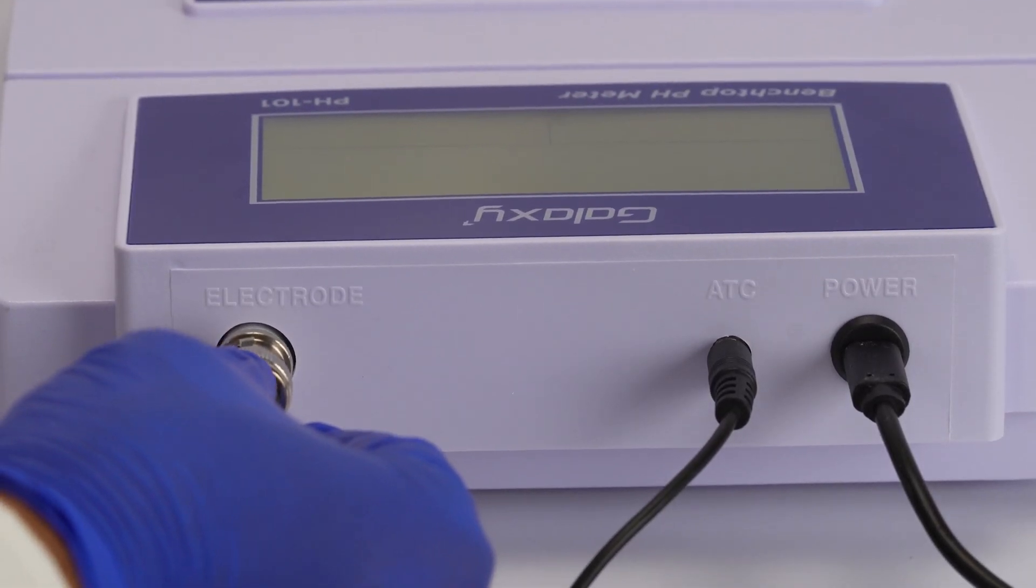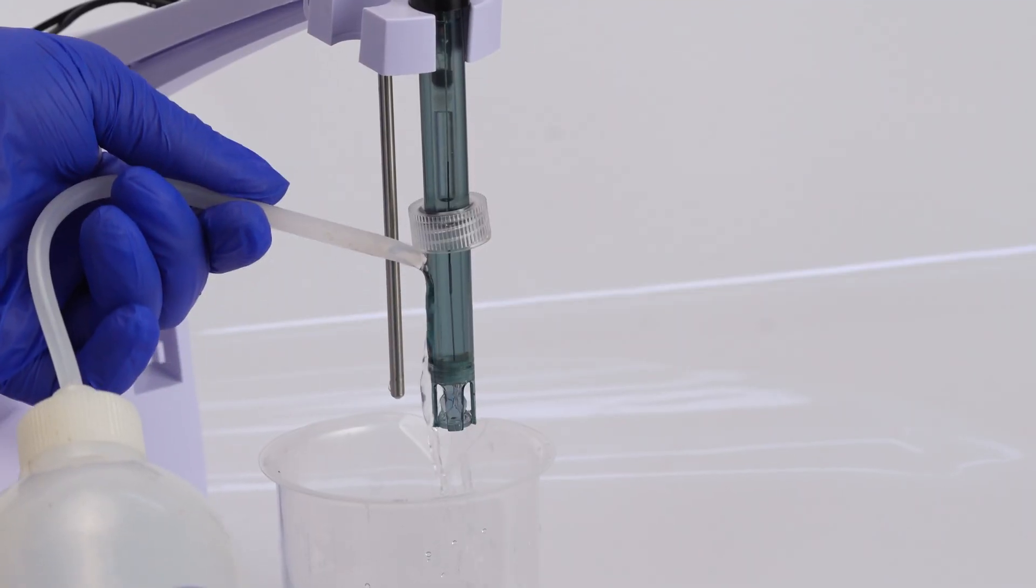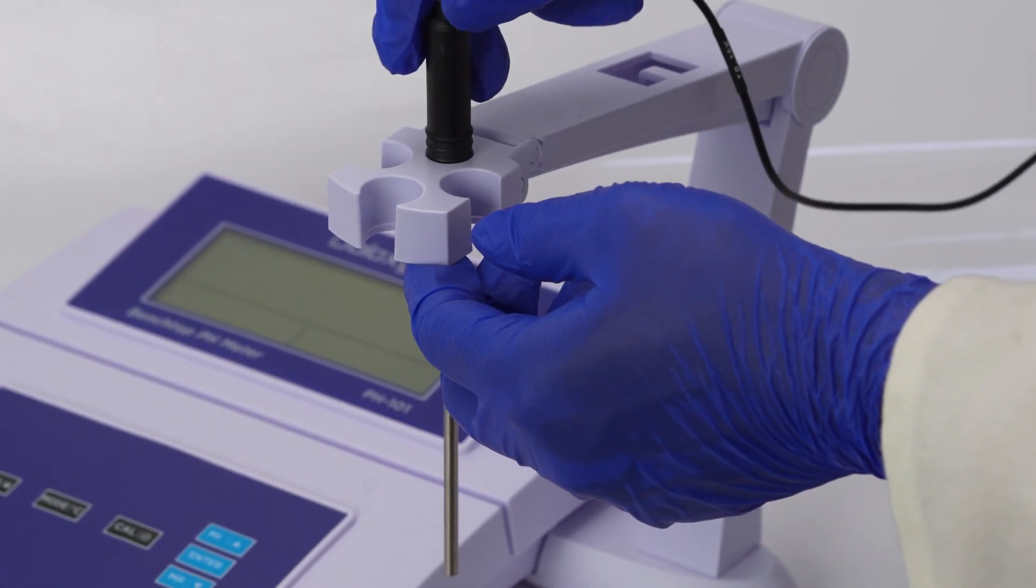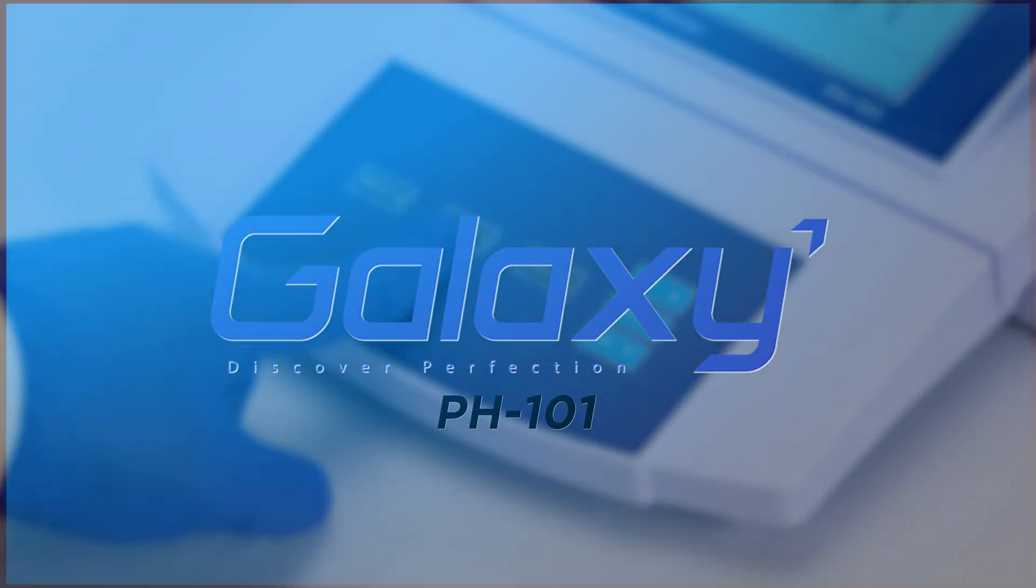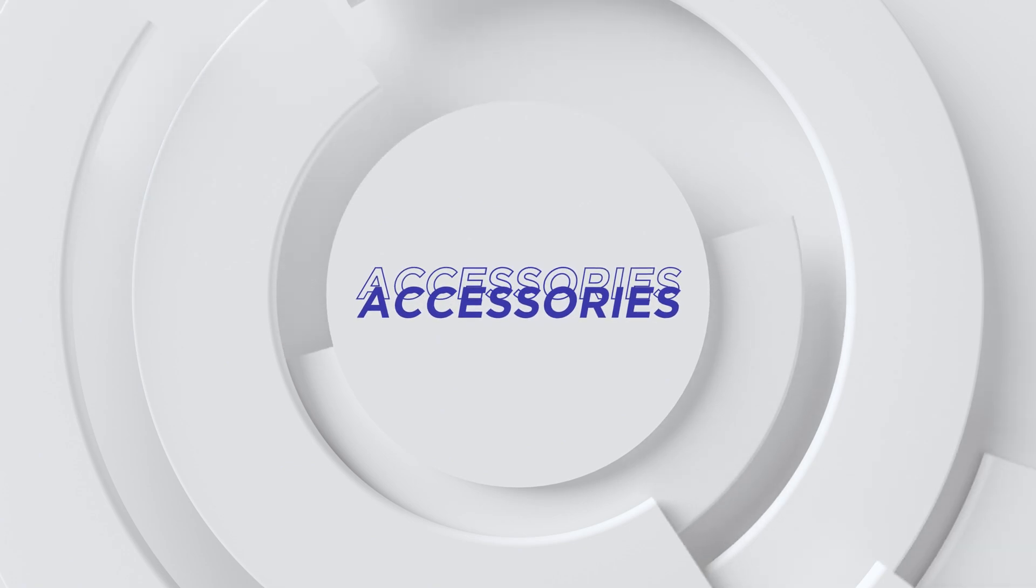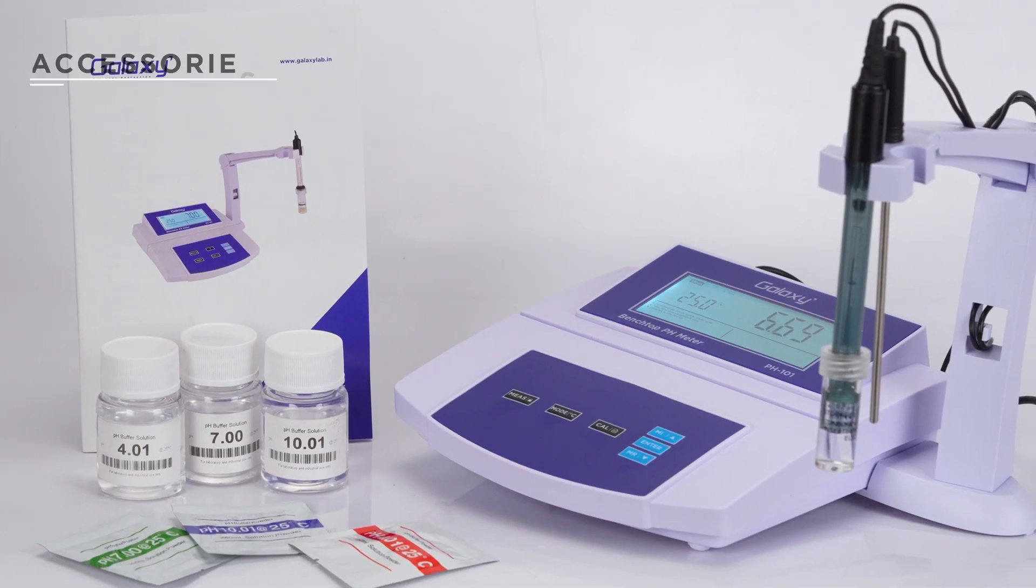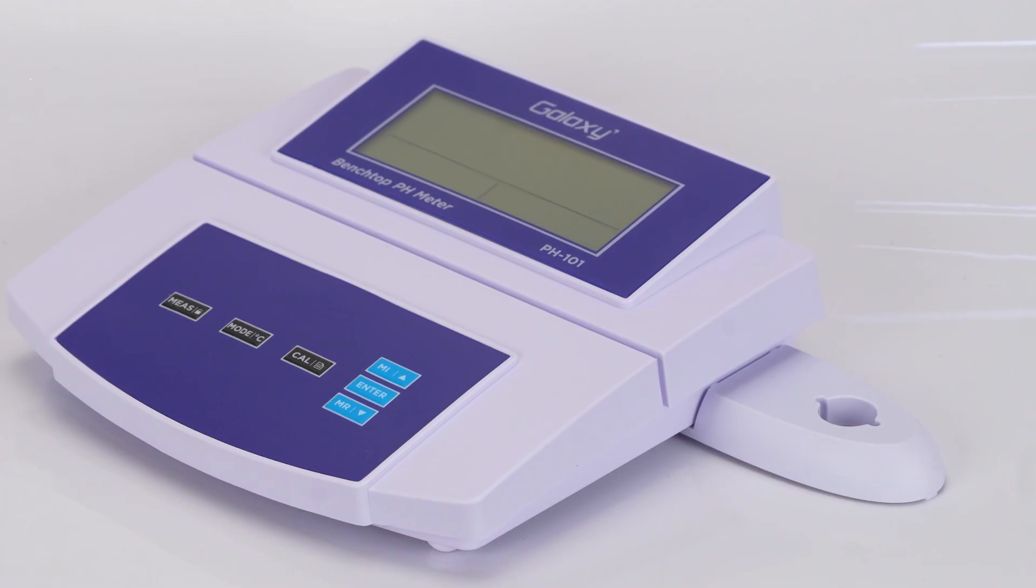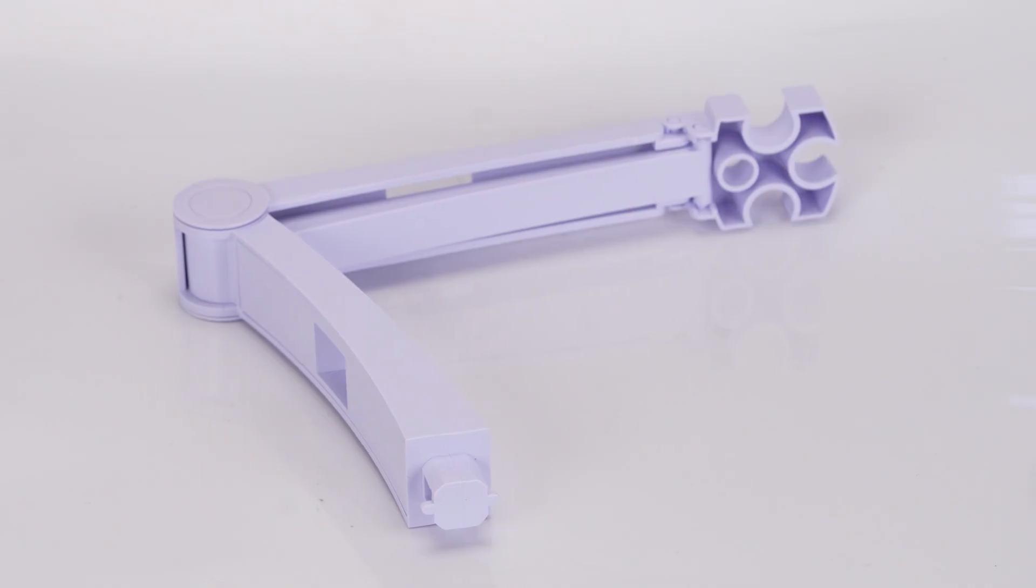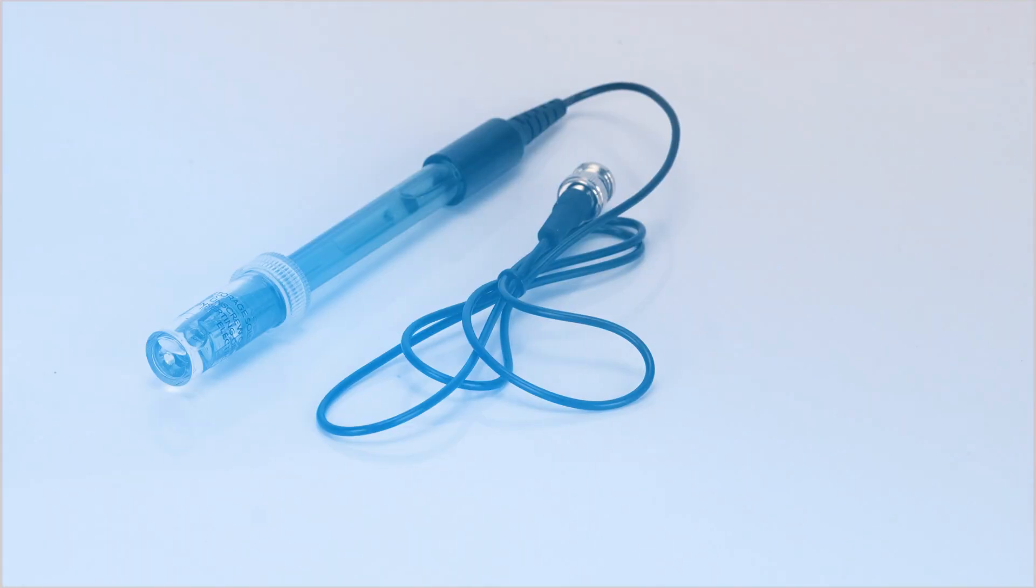Welcome to our tutorial. In this video we will demonstrate the proper setup and operation of the pH 101 pH meter, ensuring accurate and reliable measurements. The pH 101 pH meter comes with the main unit, an electrode arm, a pH electrode, a temperature probe, a standard pH buffer, power adapter, and a user manual.